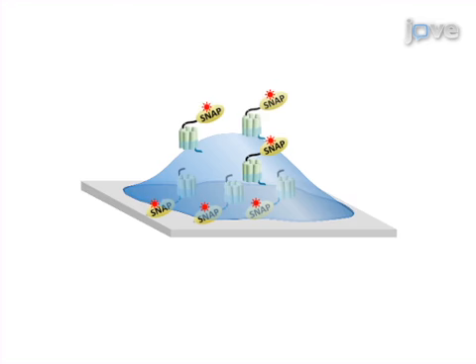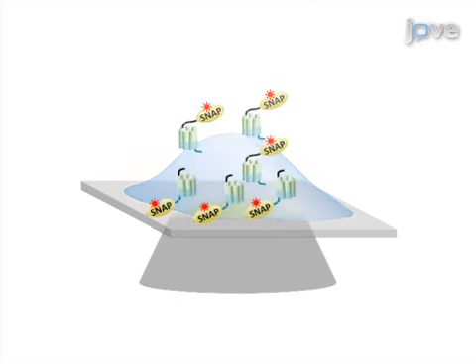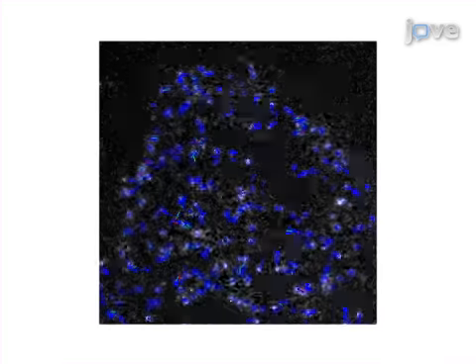As a second step, cells are visualized by total internal reflection fluorescence microscopy, which allows acquiring a fast image sequence of individual receptor particles moving on the cell surface. Next, automated detection and tracking algorithms are applied to the image sequence in order to obtain the position and intensity of each receptor particle over time.